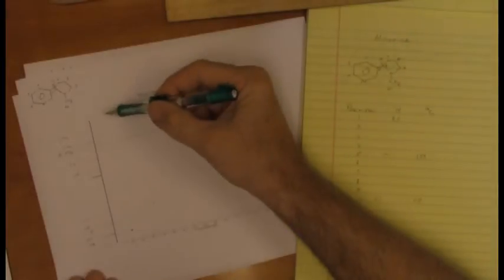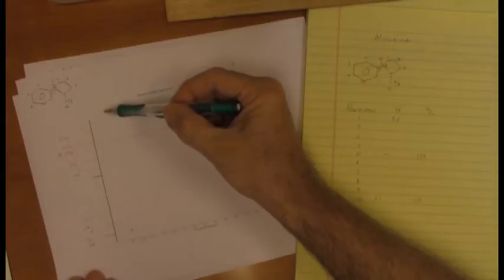And this is where our dear friend, the HSQC, plays a role. Switch over to the HSQC here, and I will look at the most downfield proton. There it is, a little small there. And sure enough, if you come down and correlate, it correlates right there to the most downfield of the carbons.